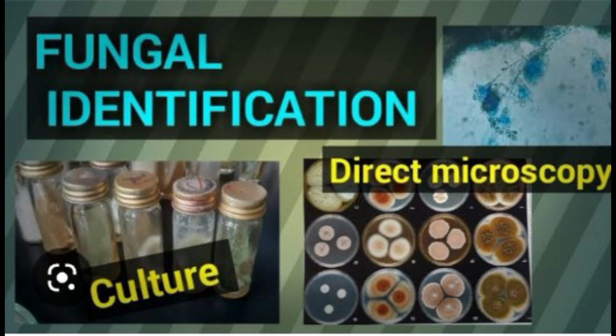Place one drop of suspension from test tubes 1, 2, and 3 on three different slides. Place cover slips over the drops. Examine the preparation under low power 10x and high power objectives of the microscope. Observation: the germ tube is seen as a long tube-like projection extending from the yeast cell. It should be differentiated from pseudohyphae. In a germ tube there is no constriction at the site of attachment, while a constriction is present in pseudohyphae. Test tube 1: germ tube positive or negative, yeast to be tested. Test tube 2: germ tube positive, positive control. Test tube 3: germ tube negative, negative control.